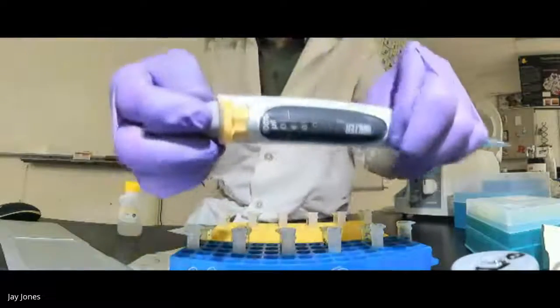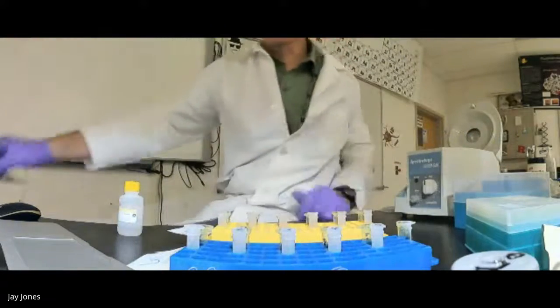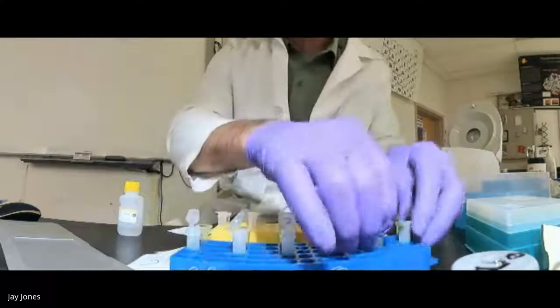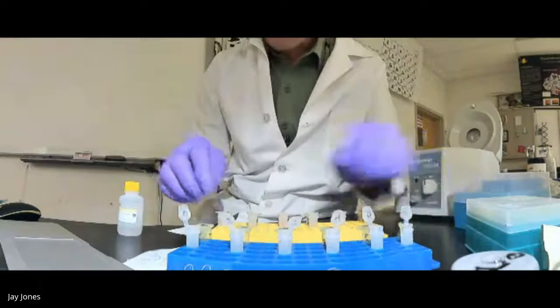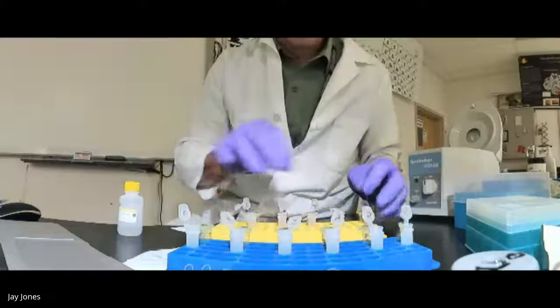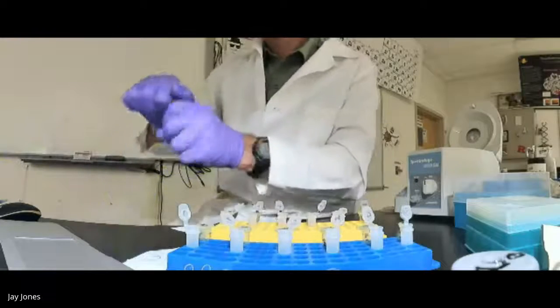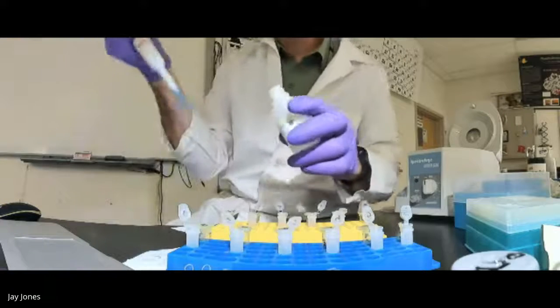We're going to use 400 microliters. Let me just double check my volumes. Yep, 400 microliters of wash. I'm going to open up all the columns. Now here's the cool part. If I drop the column, not a big deal. That column is holding the plasmid DNA. I mean, I don't want to drop it, but if I did, it wouldn't be the worst thing. Here we go. Let's add our 400 microliters of wash buffer.